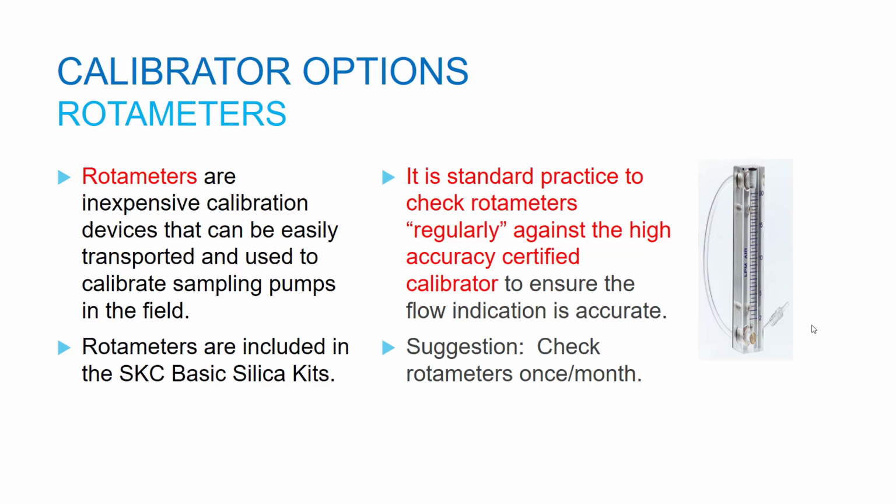Regularly is not defined by OSHA anywhere, but once a month is typical. Also note that rotometers are affected by temperature and atmospheric pressure, so check it against your certified calibrator under conditions of use.